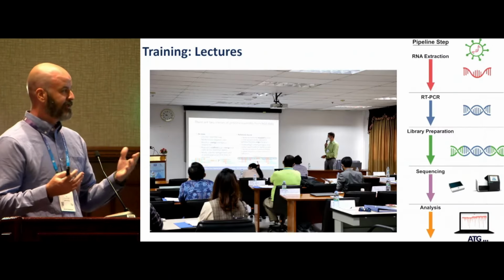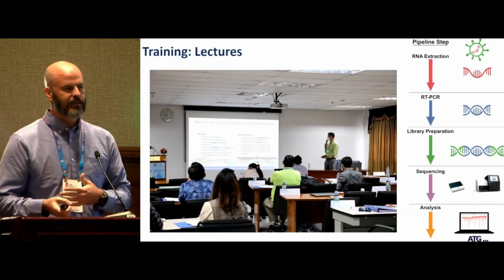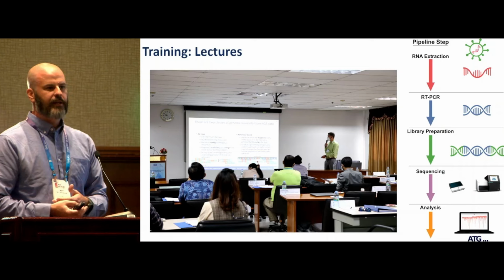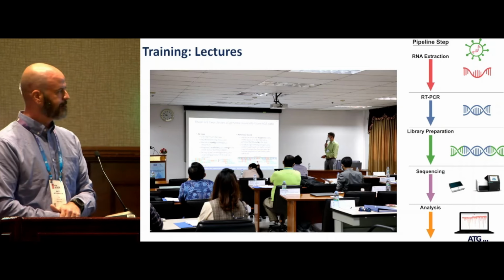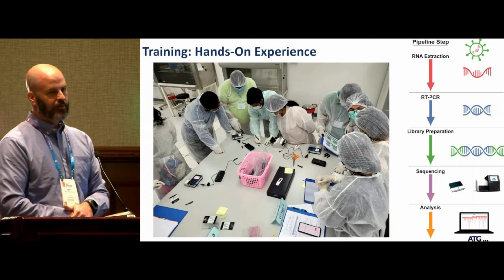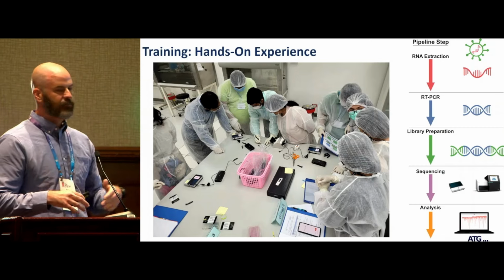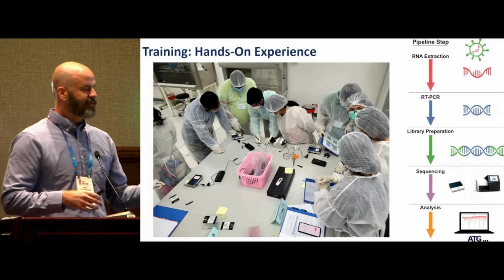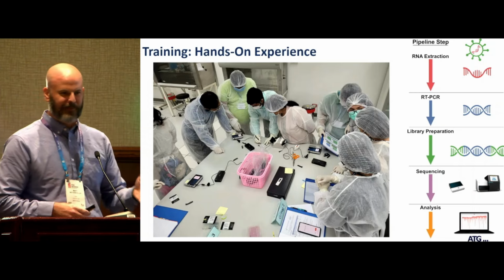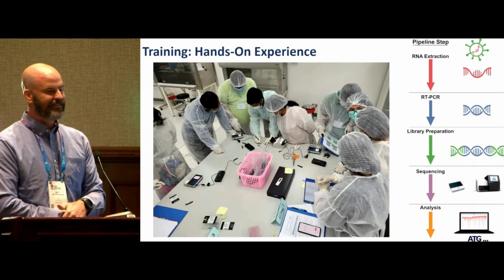There were quite a bit of lectures. There was 10, maybe too many. There was 10 lectures that really cover everything from sample selection, how the lab works, how assembly works, and how to upload data. And importantly, how to do data curation and QC and all of those good things to get quality data uploaded. There is, of course, hands-on experience. They tested real samples, generated real data, and we copied that data onto all of the laptops that they brought and let them analyze all the data themselves. One, to get the experience running the analysis software, but two, to make sure the install worked. If you've tried deploying some of your own developed software, you know that there is a great diversity of computers out there that people use, and that is certainly a challenge in this.